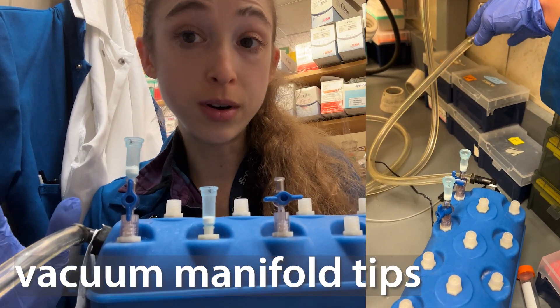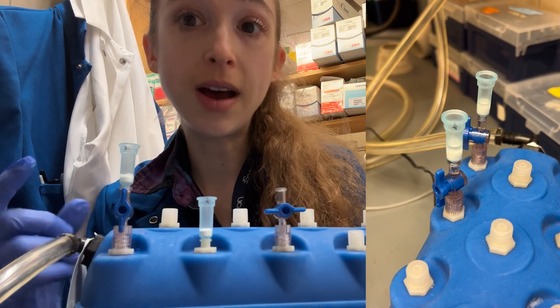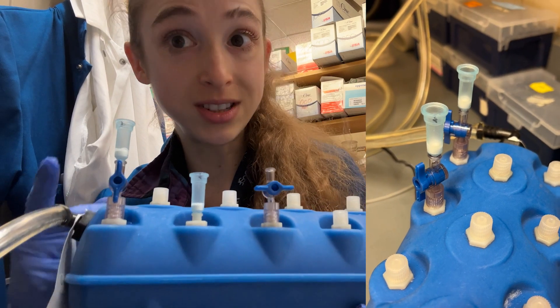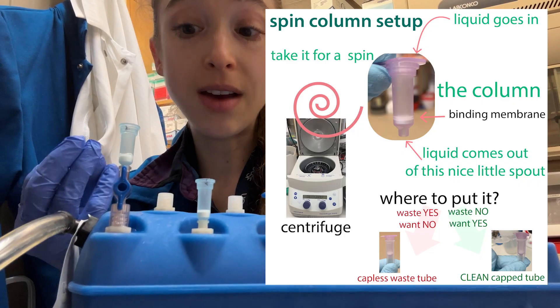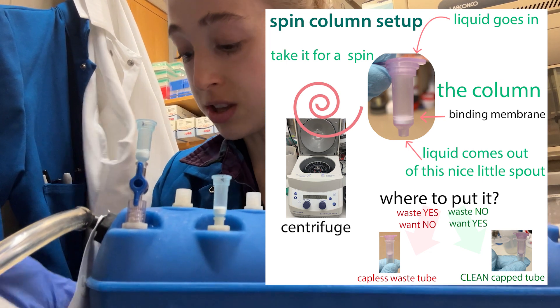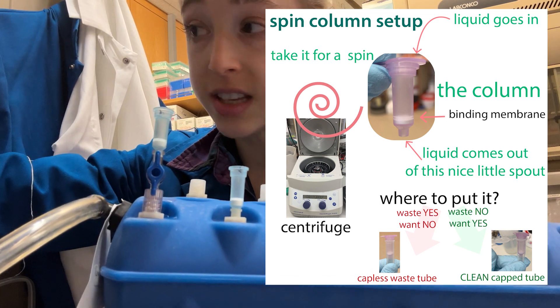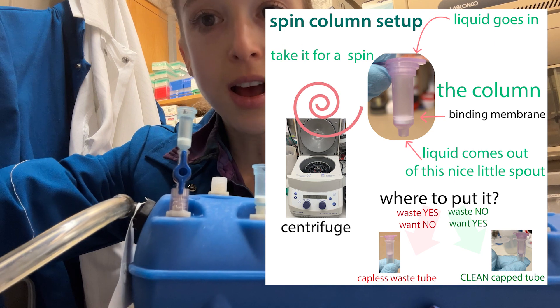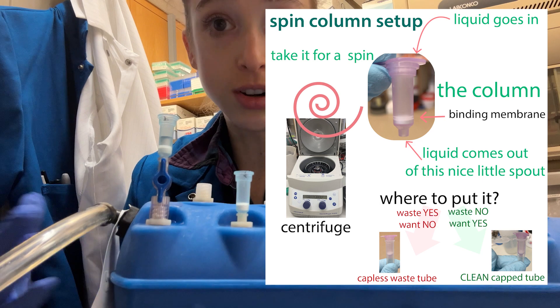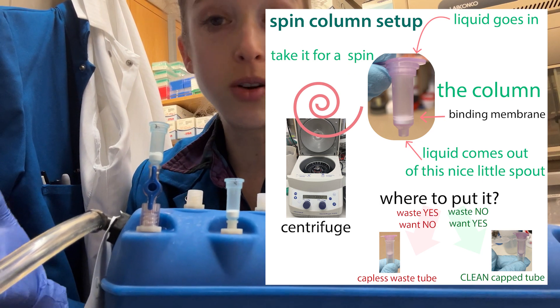Spin columns can be really handy for nucleic acid purification, such as a mini prep. But if you have a lot of samples, or if you have more volume than you can load in a single go, then these vacuum manifolds might be the way to go. So instead of having to go back and forth from the centrifuge a bunch of times, all you have to do is put your liquid into the column, and then instead of centrifuging it to pull things through, you turn on the vacuum and it pulls things through. The concept's really simple, but there are a few tips, so let's get into them.